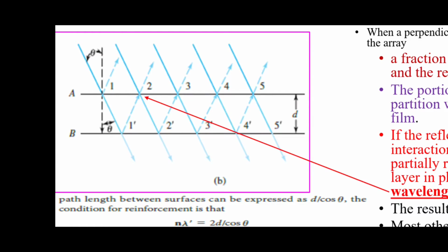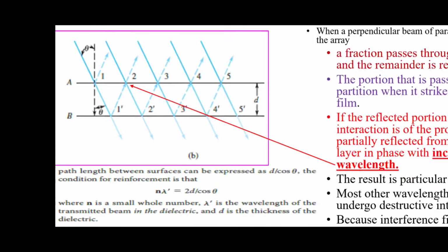That reflection is 1 dash as per the picture. That 1 dash again hits the previous layer by reflection, and that also interferes with the incoming new radiation which has the same wavelength, or after the interference it produces the same wavelength, so it gets reinforced. Hope you have all understood.